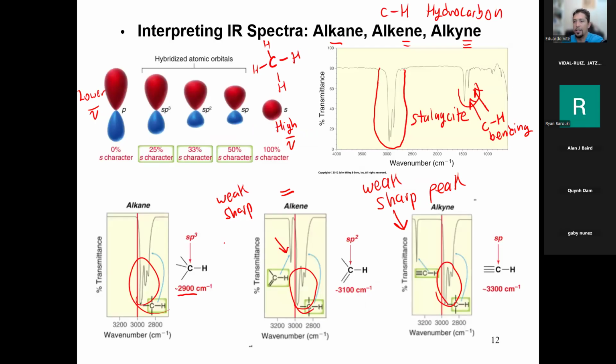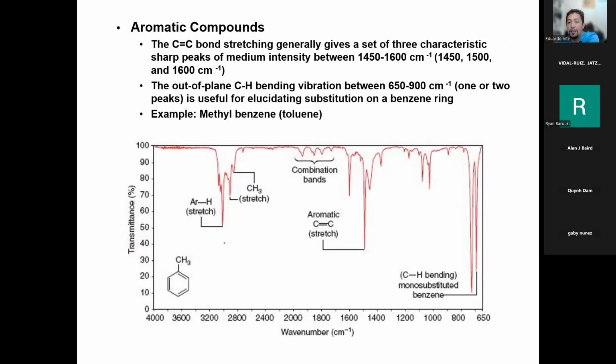So yeah, maybe this one. Look at the stretches, right? They're kind of sharp, but not really sharp. You still have a very broad signal. But look at this one. Almost all of the peaks are extremely sharp. They look like needles. And also look at the intensity of your stretches.